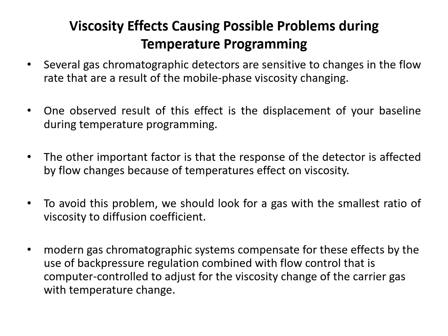to diffusion coefficient. Usually, class, modern gas chromatography systems compensate for all these effects by the use of back pressure regulation combined with flow control, which is computer controlled. Basically it adjusts for the viscosity change of the carrier gas with temperature change.